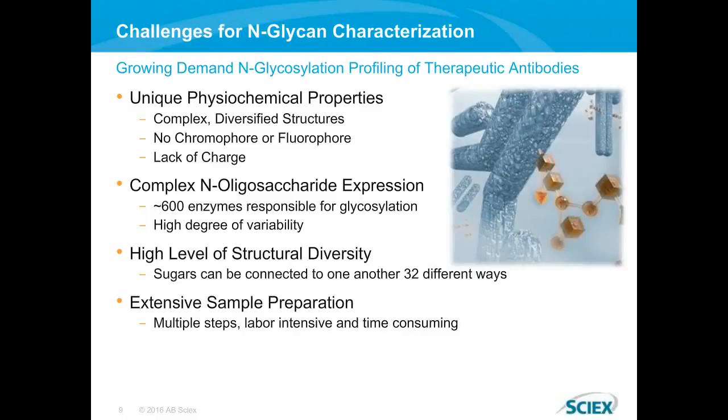So for those of you that maybe aren't doing N-glycan analysis now or aren't familiar with glycosylation analysis, I just wanted to, again, frame the conversation around why we care and why we do this. There are a number of challenges for N-glycan analysis, but we're seeing a growing demand for glycosylation profiling of therapeutic antibodies. The reason that they're challenging is because they've got a lot of unique physicochemical properties. They're very complex and diverse.